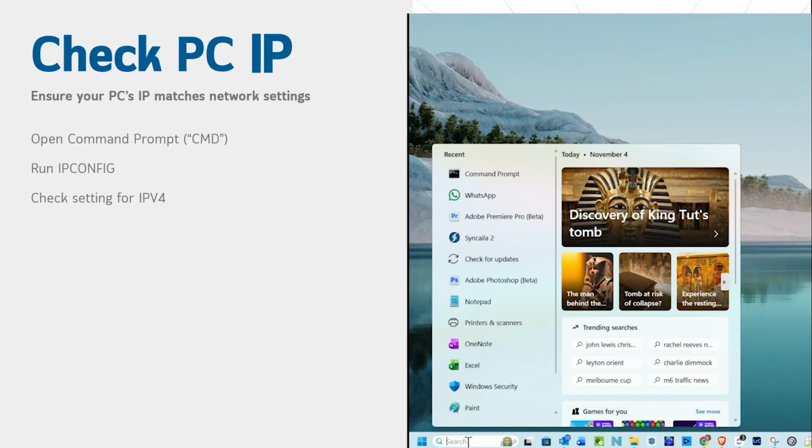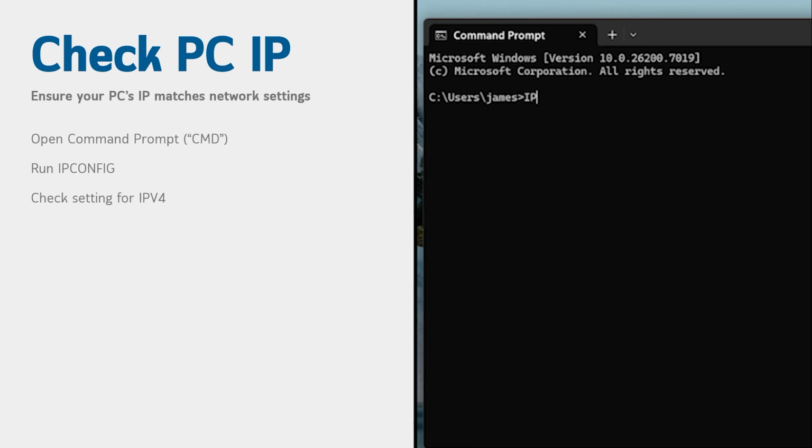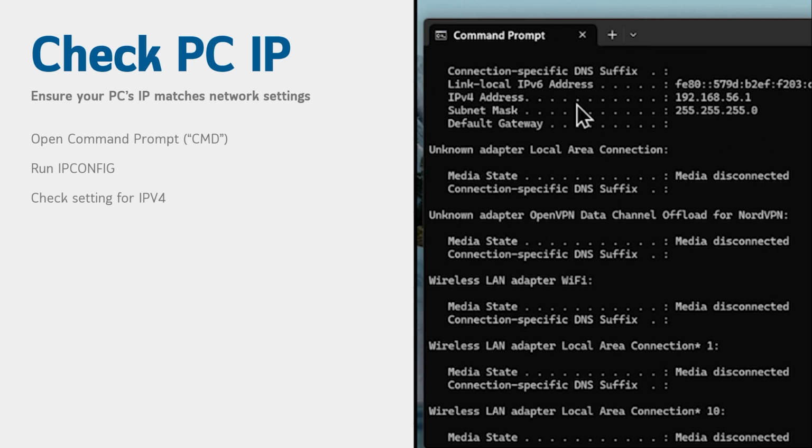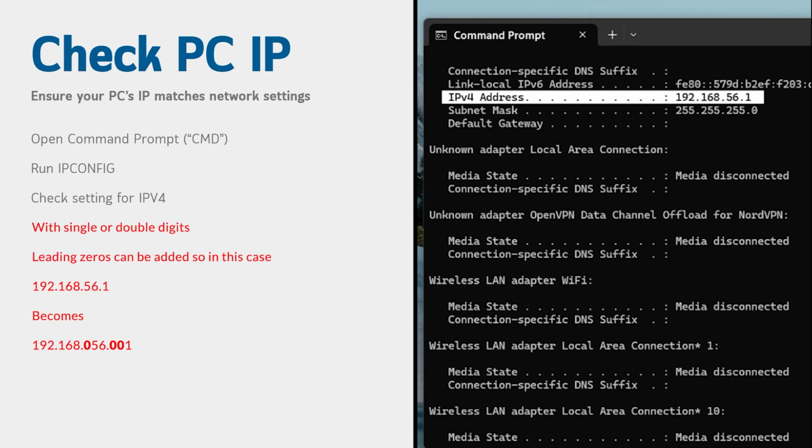To check the IP address of your computer, open a command prompt and type ipconfig. That's spelled ipconfig. Look for the line that says IPv4 address. To ensure that both devices, the computer and the instrument, are on the same network, we need to compare the addresses shown in ipconfig and the IP configured for your GC inside the Chromperfect configuration utility. Both should share the same first 3 number groups, with only the last 3 digits being different.